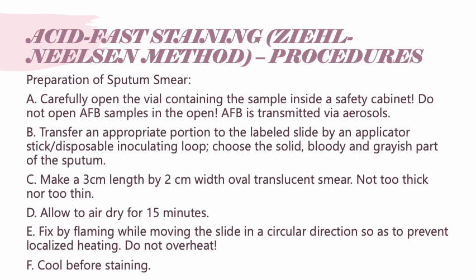Now, the next thing to do is make a 3 cm by 2 cm (length by width) oval, translucent smear, not too thick nor too thin, and then allow it to air dry for 15 minutes. To hasten this air drying process, you can use a warmer plate, so that our smear dries faster.